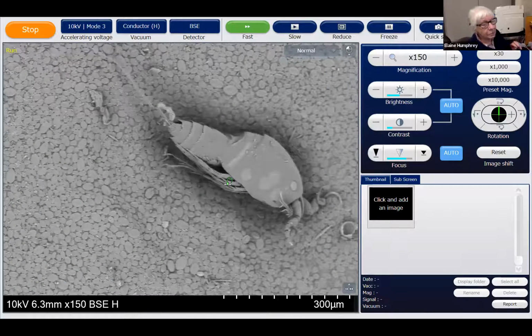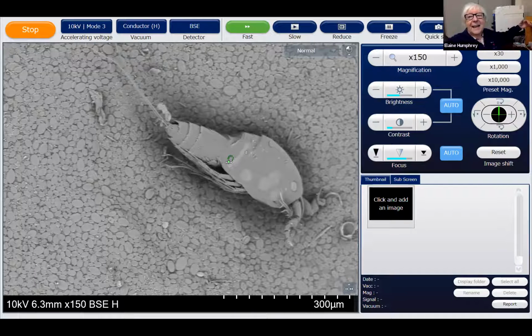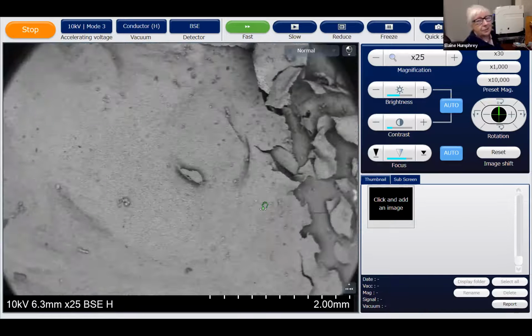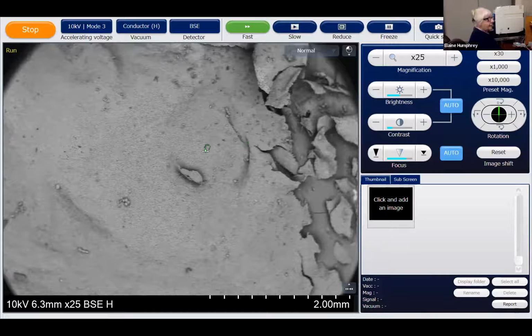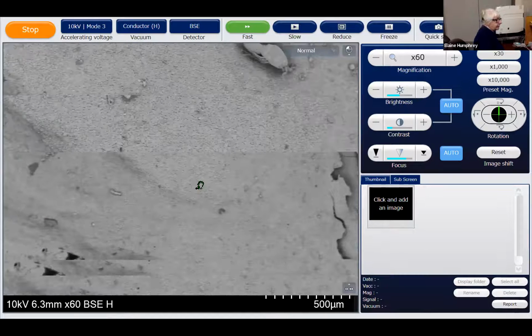So zooplankton are the animal planktons, and this guy is one of the most abundant. He's in a group called copepods. If they have very long antennae, then they're herbivores. If they have short antennae like this one, these antennae here, then they're usually predators. And so the school kids labeled this one Lewis, but I'm going to take you to see Bob in a minute. But there's another animal on here. Where is he?